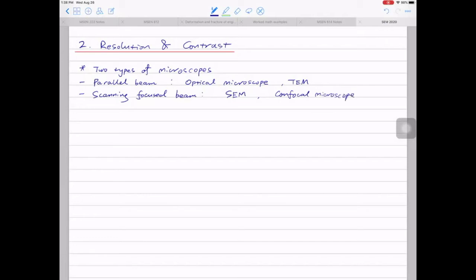In confocal, instead of using an electron beam, you use a laser. You use a laser to scan the specimen pixel by pixel. Maybe you guys are too young to know how the old TV sets looked. Nowadays, you have a flat screen. You don't see the old style TV anymore. When I was a kid, the TV sets used to be like boxes.